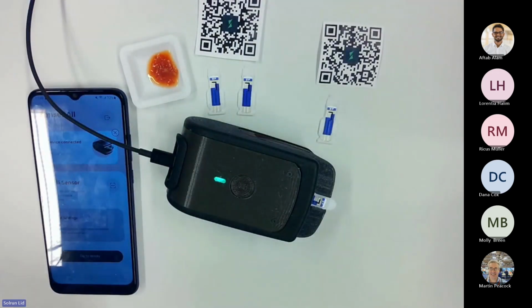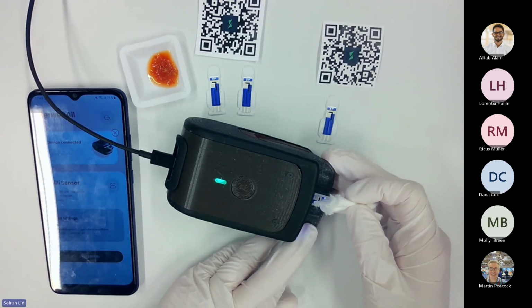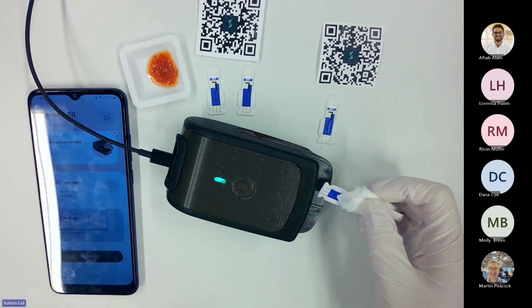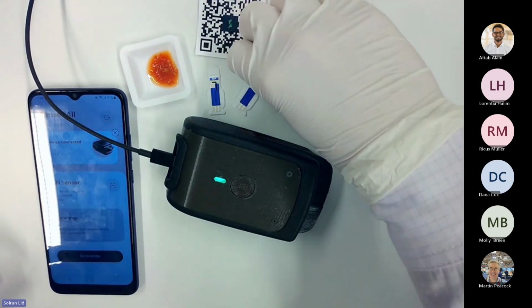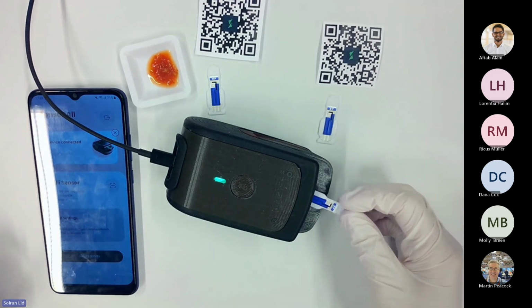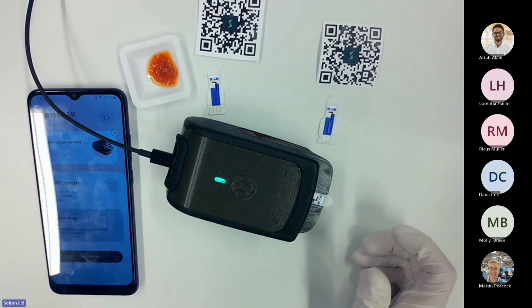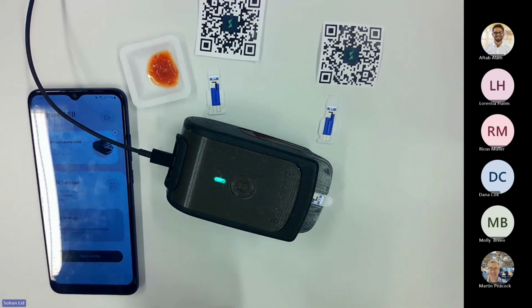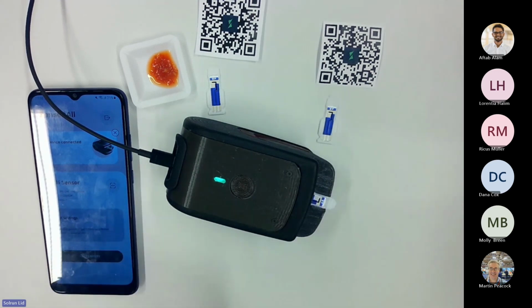Okay, so I will again go to the close-up camera. So these sensors are one-time use sensors, because these organic molecules do like the surface of the sensors quite a lot. So if you would test them over, not dispose them, but retest one, the capsaicin from your last measurement will still be stuck to your surface, and you won't get correct results. So that's why we use new sensors every time.